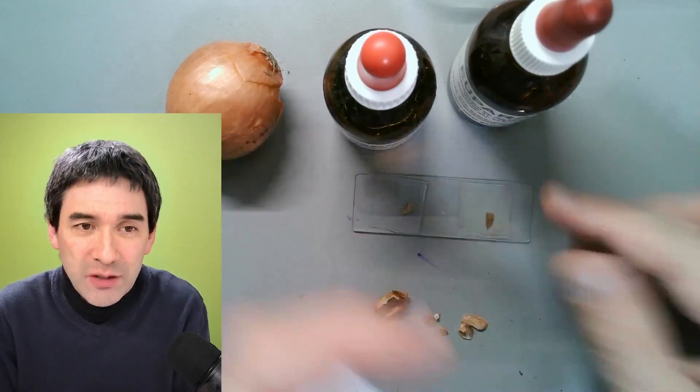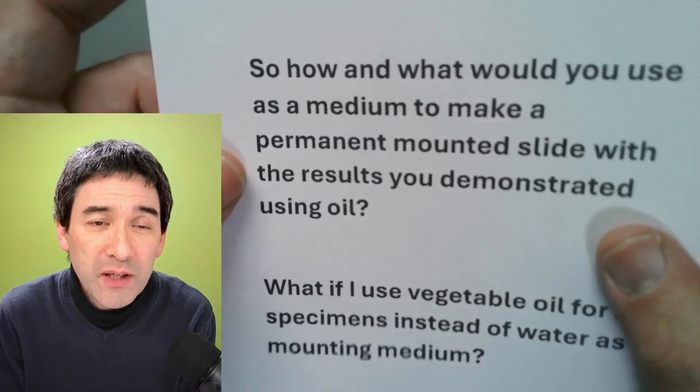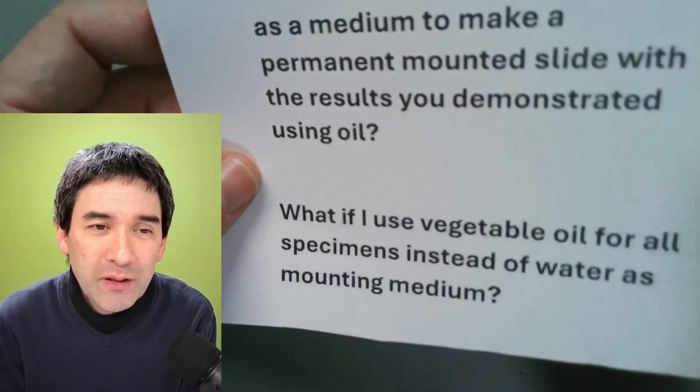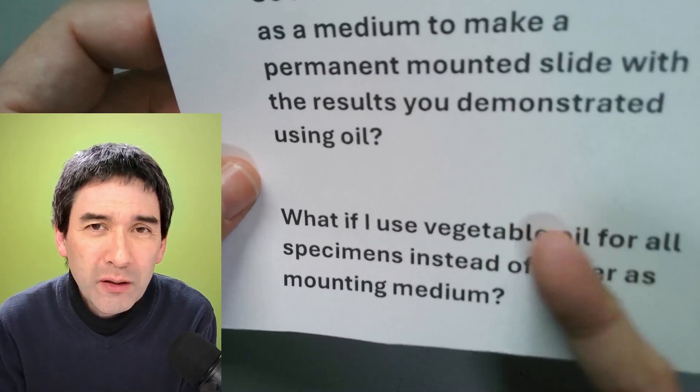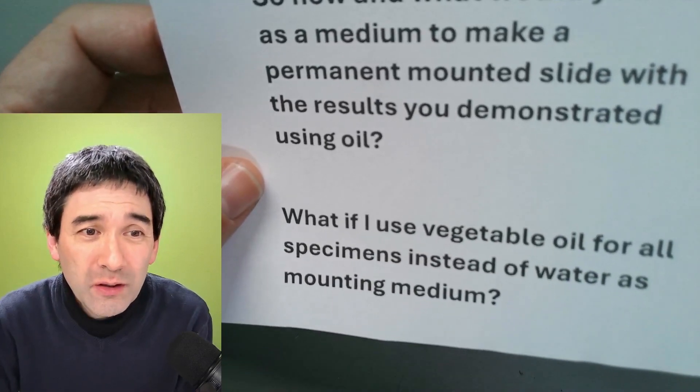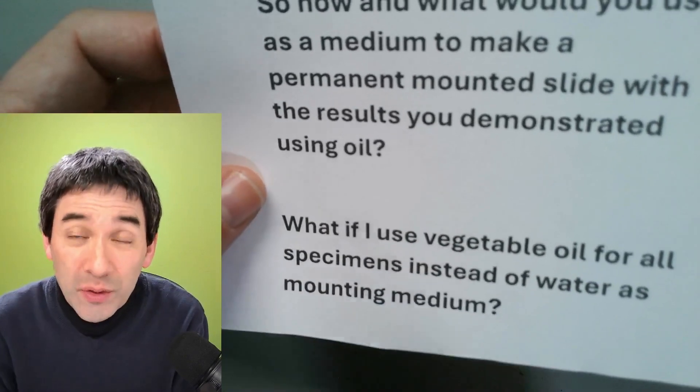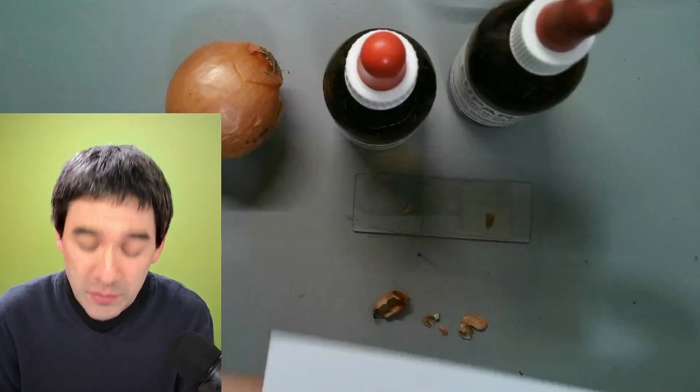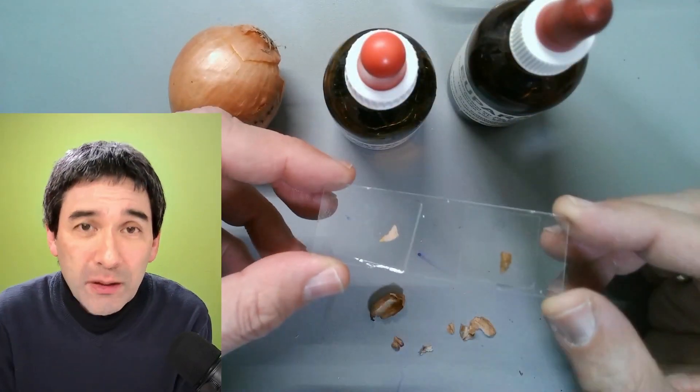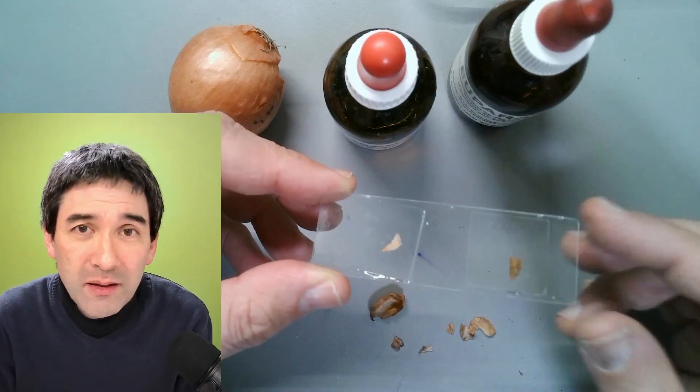That would then basically address the first question. And you can see that we can use the right mounting medium. And then later on, why not use vegetable oil what I used yesterday in the onion video? Why not use vegetable oil for all specimens? That's an interesting one. There are several reasons I'd like to explain later. But for right now, let's put this under the microscope and you're going to see quite a big difference.